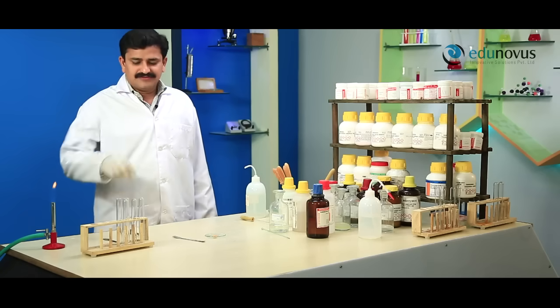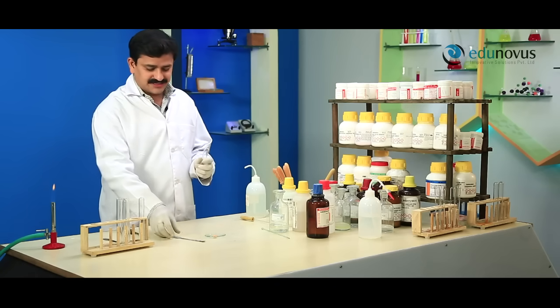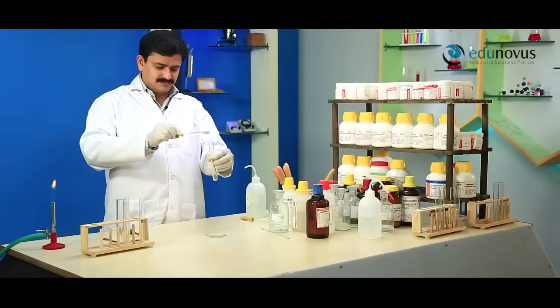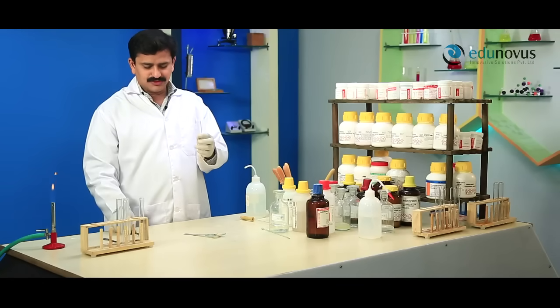Take a small amount of given salt in a clean and dry test tube and heat it using Bunsen flame.